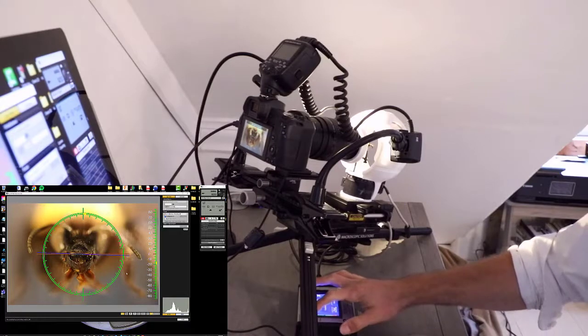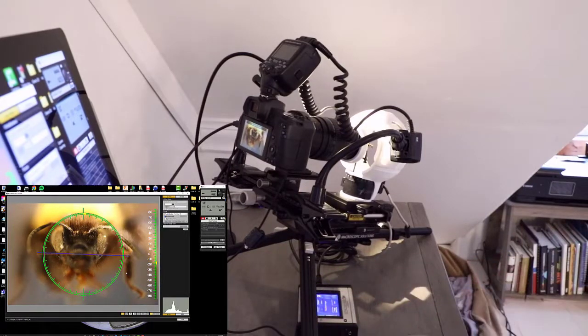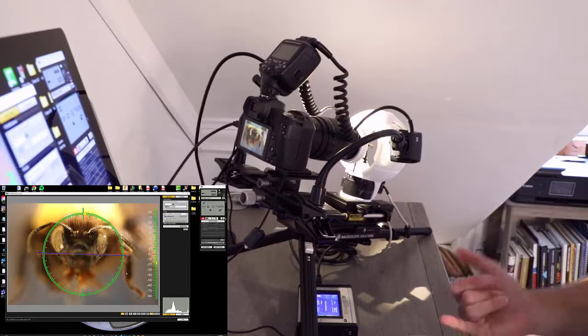But with dark specimens, a black background sometimes doesn't contrast very well. The more detail that you want to reveal in a dark colored specimen is generally achieved by stepping up the magnification. That's the first thing.